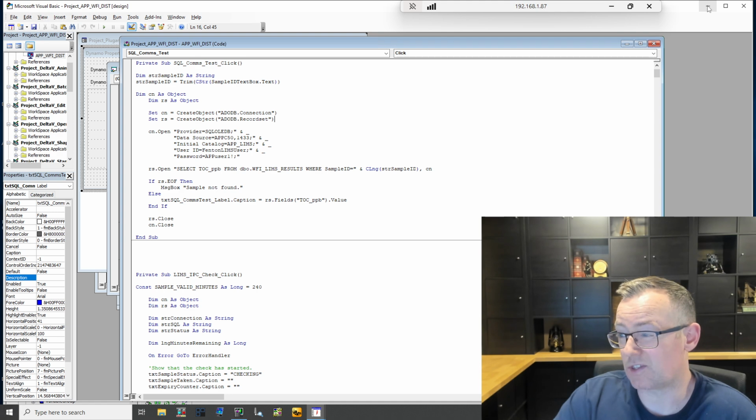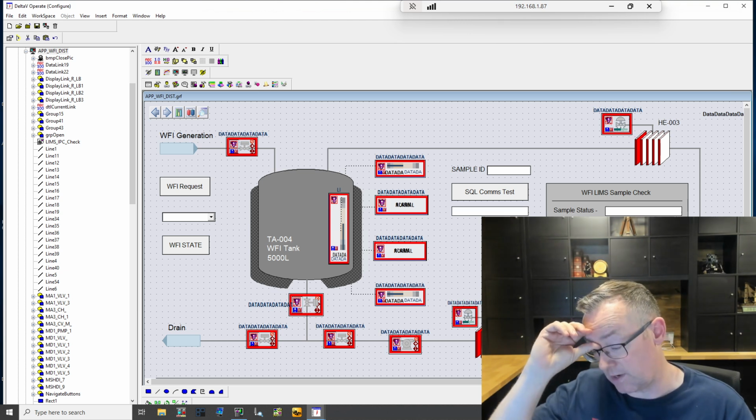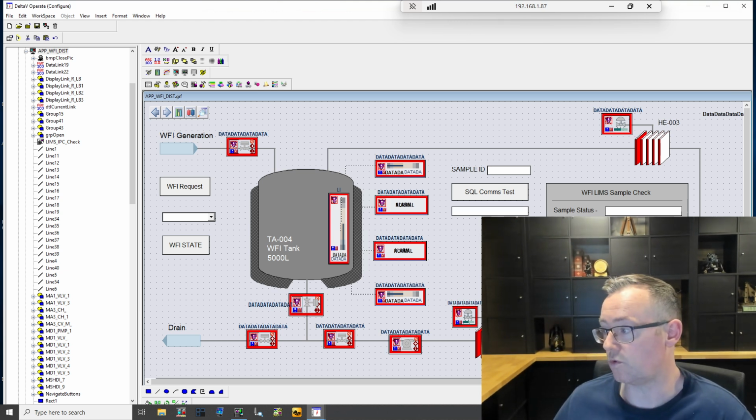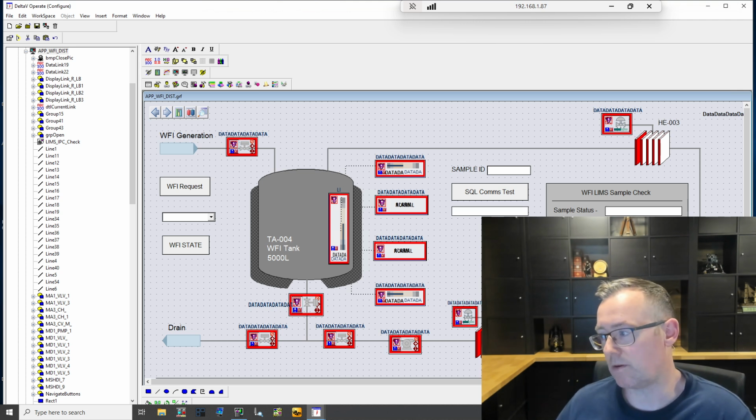So it's extremely useful, in my opinion, to use VBA in the background. But certainly when it comes down to SQL queries, where you have an external system, the best option, in my opinion, is to go down this road if you don't want to have a third-party application.